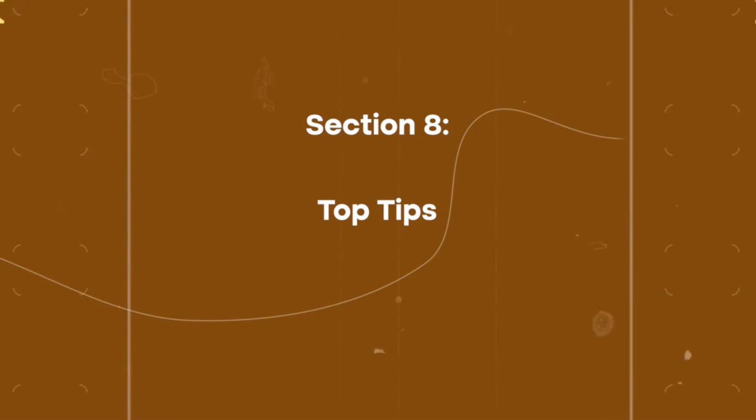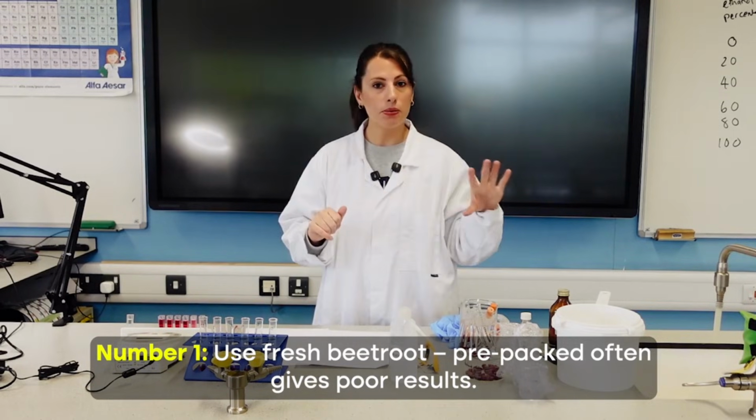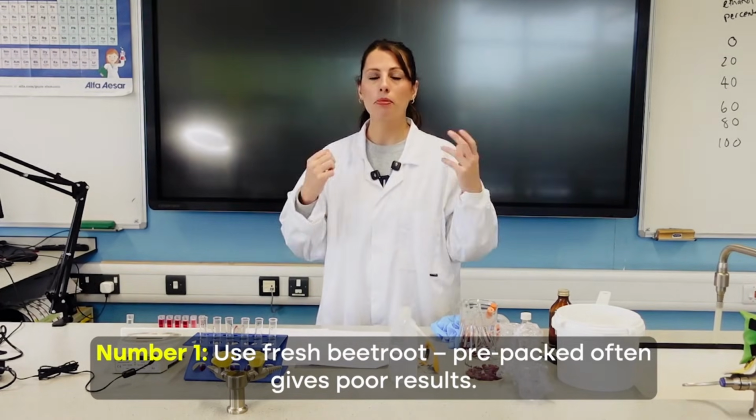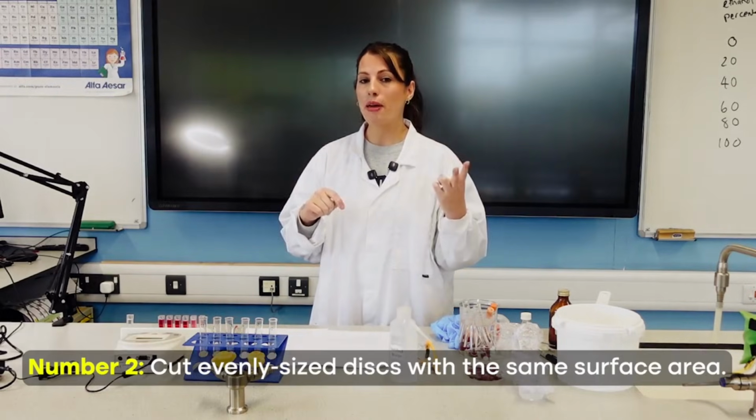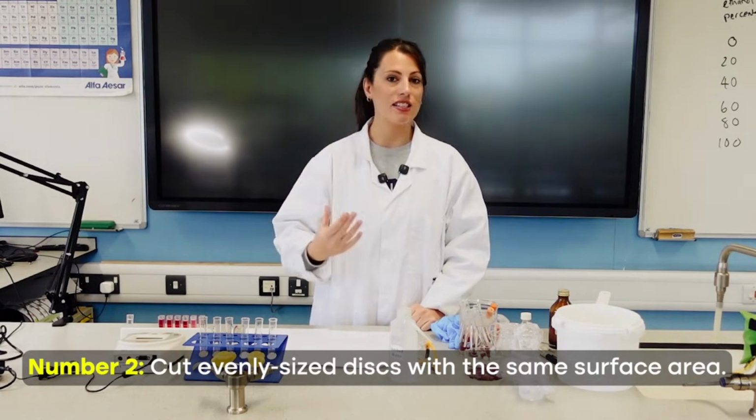So finally, just a few top tips to help your students succeed in this practical. Number 1 is making sure you're using fresh beetroot, not pre-packaged, even if it still says it's raw, because you get better results. Number 2 is making sure that the discs are cut to even sizes so they are the same size and surface area.